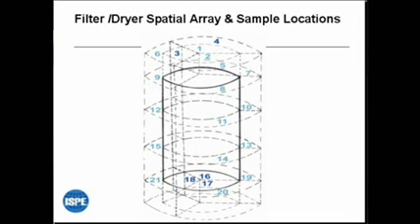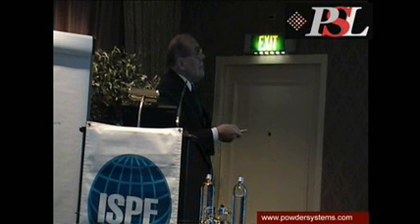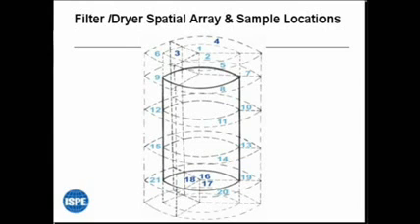And then we subtend them 1 volume outwards outside the shell. So we now have created, as well as putting an extension above and below the device. So now we've got a shell around the hardware. That should be our homogeneous shell if there is no release. Number the cells, and then using a random number generator, select 5 consecutive locations. And we turned out with 3, 4, 16, 17, and 18. It's random. There was no bias on what we did.